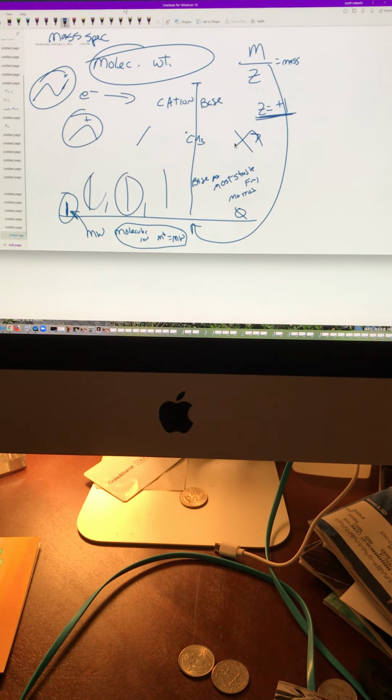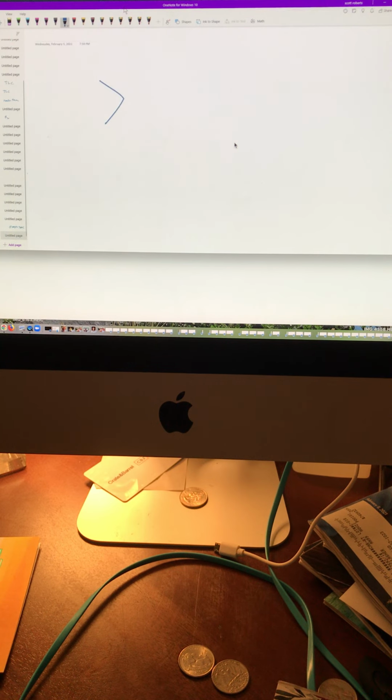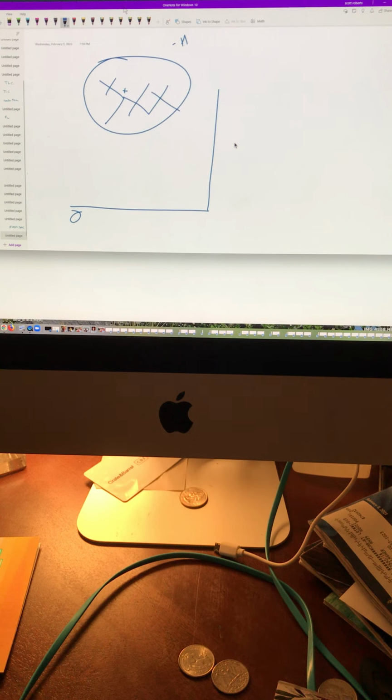So what are all these other peaks? They're all fragments. If I had this, what fragments would I get? This one is my most abundant because it's the most stable, since I lost a hydrogen. I split a hydrogen off. In this case, it would probably give me a base peak equal to my molecular weight. But you're also going to get this, and this, and this. It splits everywhere you can split it. So you'll certainly get a propyl fragment and an ethyl fragment. Got it?